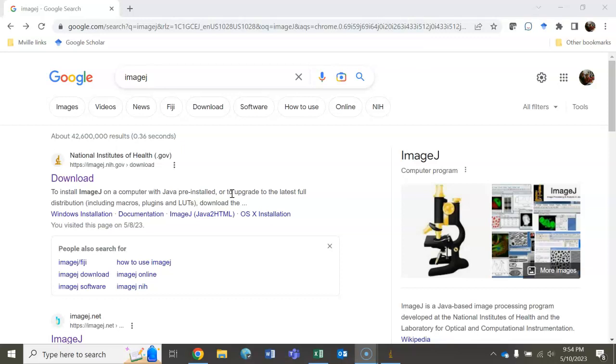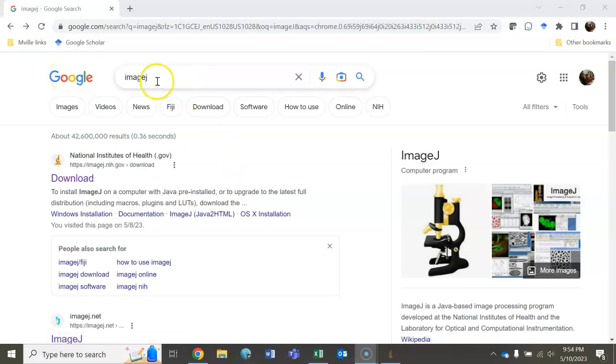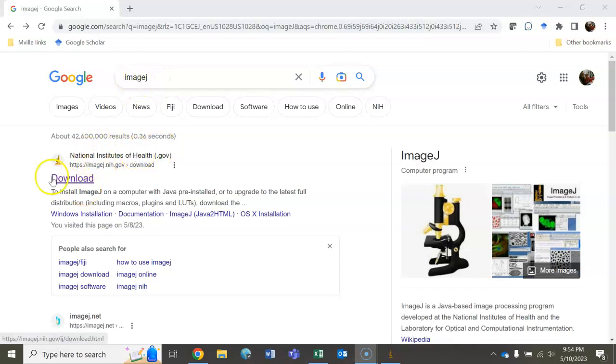To do this, go to Google or Firefox or whatever and type in ImageJ. When we do that, we see the first hit is from NIH and it says ImageJ for download.